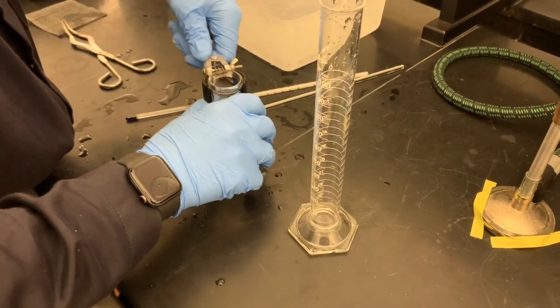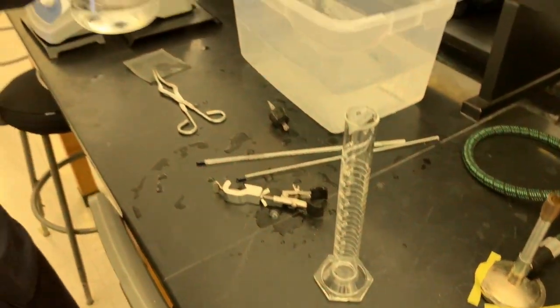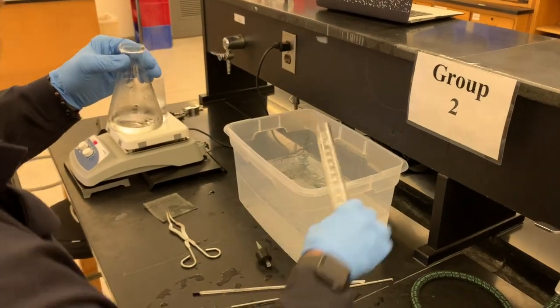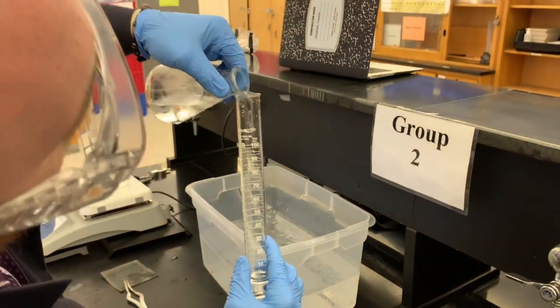where we're going to measure out exactly how much of that liquid we took in. We have a graduated cylinder here instead. Much better way to measure this. There's going to be some transfer loss, that's to be expected. And just dump a little water in there. And we're gonna see how much we got.